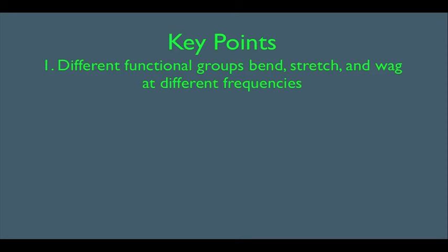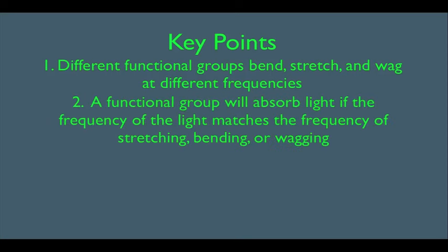frequencies. We're also going to learn that, two, a functional group will absorb light if the frequency of light matches the frequency of stretching, bending, or wagging. This is going to be our most important key point. This is the basics of how the IR machine functions.